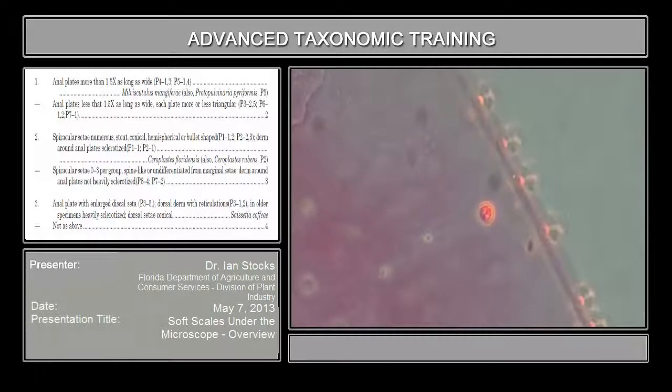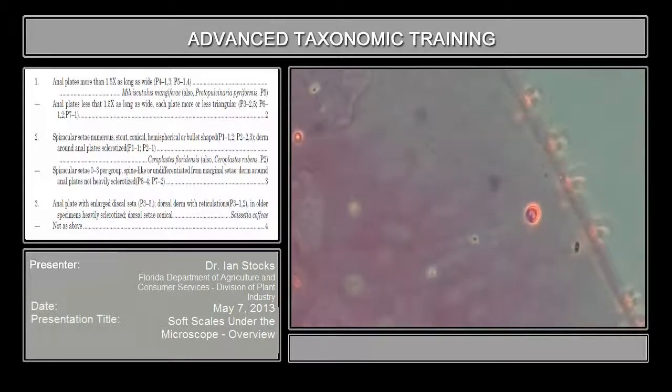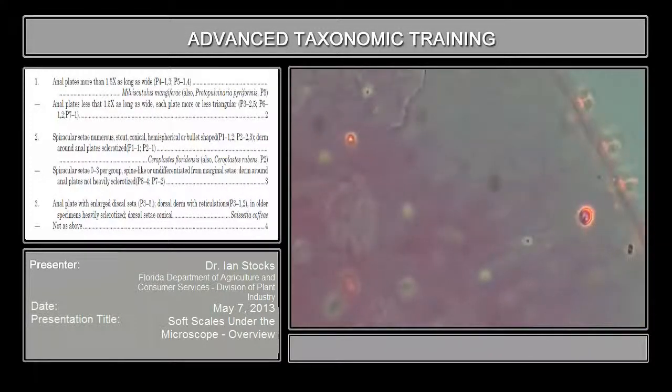These can vary at the species level from 0 to 10 or more. And even within a species in a population, you can find some specimens that have a number of them along the margin, and then some other specimens where they have none. They're restricted to the body margin when they are present.